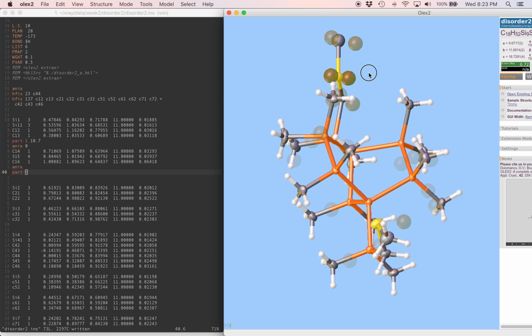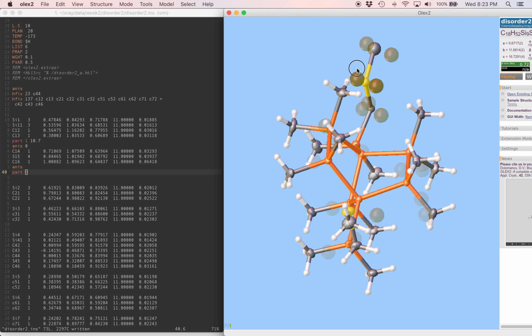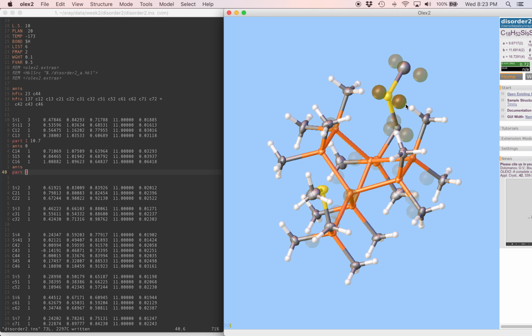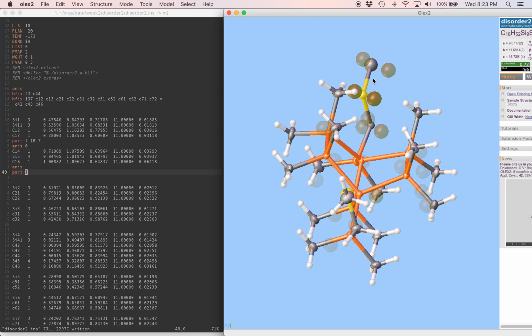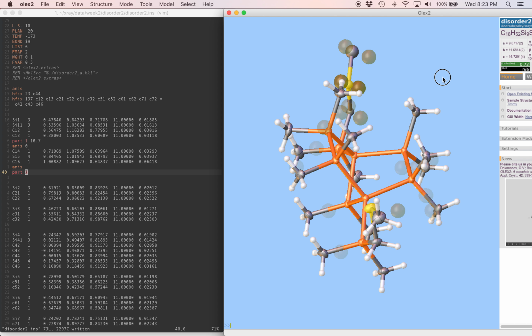All right, what are we looking at now? This might have come out a little strange. I can see now the two biggest difference features. It's not two disordered positions of this atom. Instead, it's just the anisotropic vibrations of this atom coming back as big difference features.